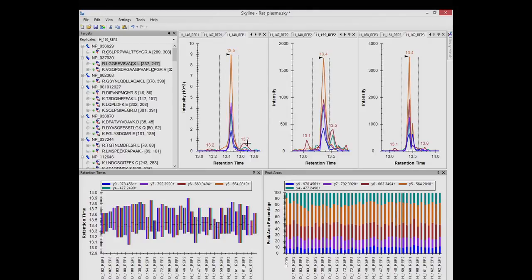And it's here again at 13.5 or 13.7. There's some other peptide, and in this case, my peptide's much more abundant and it's low abundance, but that could change, right? If I'm trying to measure low abundance, this might become most of my signal. It's definitely on which transitions am I seeing it on most?